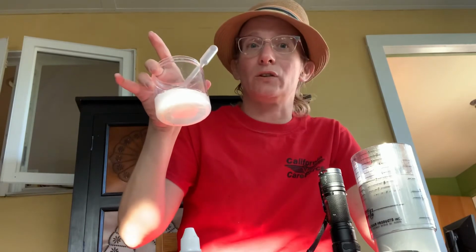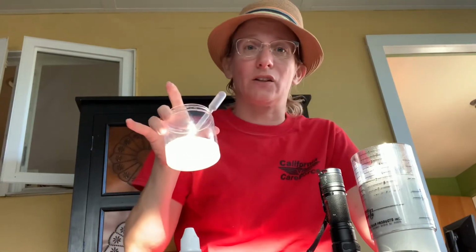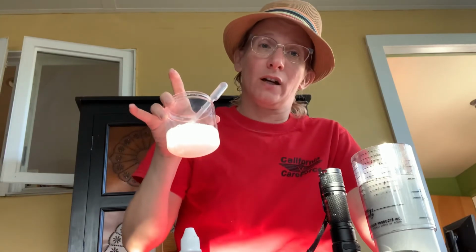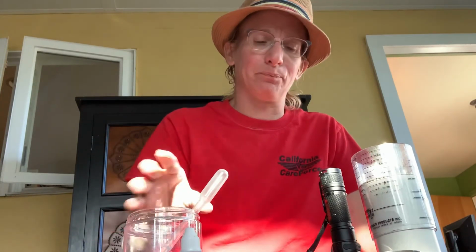Oh, another thing with the Holtz milk test is that I'm told you can also use that on scale. So if you have just a hive that's completely dead and there's no longer any dying larvae to use, a dead out hive, and you want to know if those frames are going to be safe for you to use in future, you can do the Holtz milk test on that.